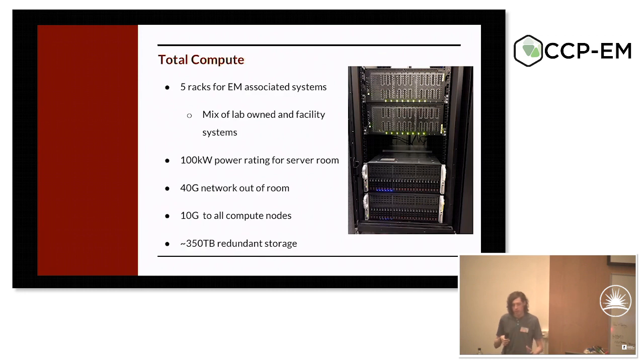And this is all underpinned by fast networking and a huge amount of cooling, actually. We have 3 times as much cooling in our server room as is required to run it, because if one of those coolers dies, that's okay. If 2 of those coolers die, it could happen in a short period of time, and then all hell breaks loose. And you might notice that we have very little storage provisioned, and that's something I'm going to touch on again towards the end of the talk, because honestly, we didn't want to deal with user storage.